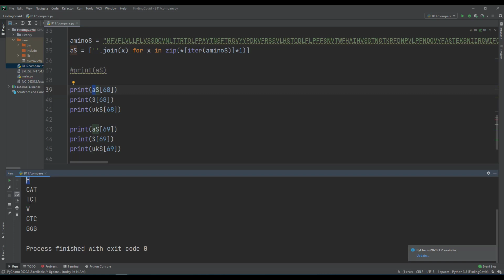These are the deletions, the 2 amino acids that get deleted in the spike protein. Our reference file is showing histidine and valine, but it's also showing 2 different other amino acids. The reason is that it deleted and then it shifted over into the positions.